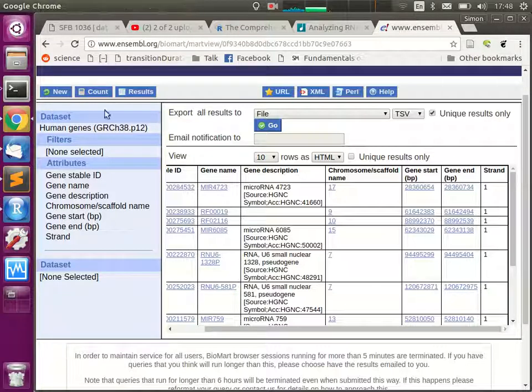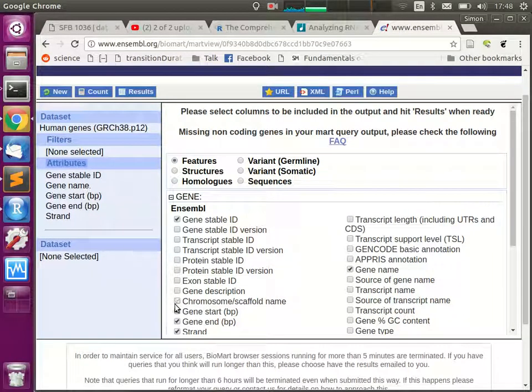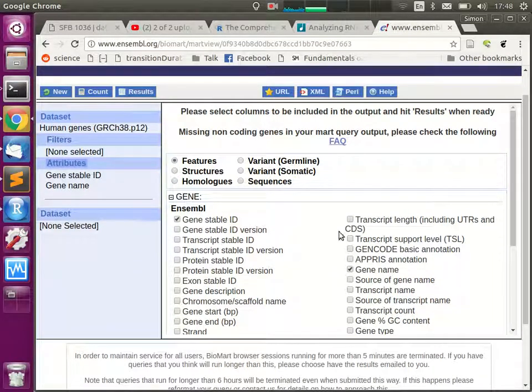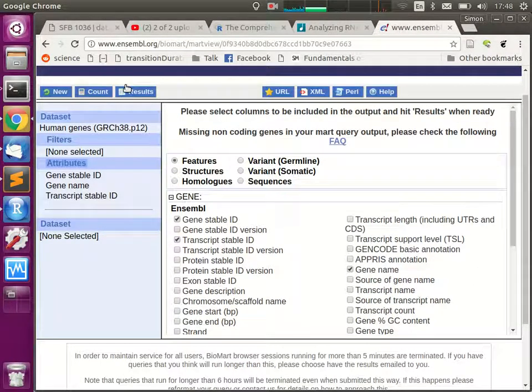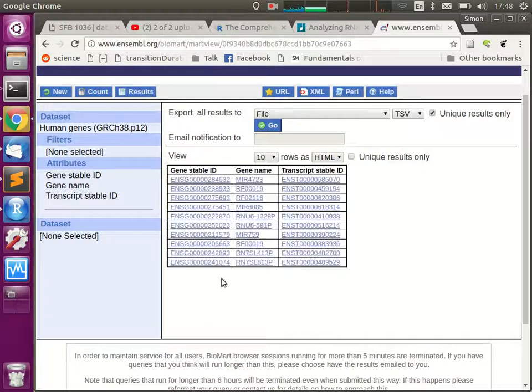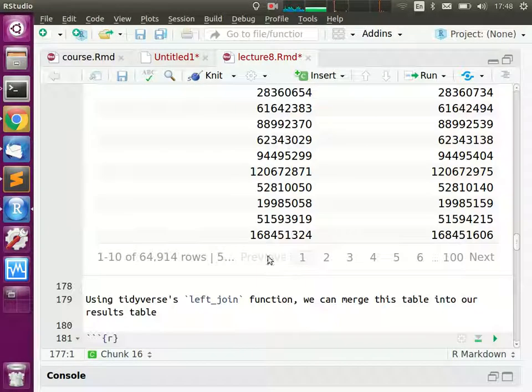And where it appears twice is, for example, and that's the reason why I said I don't want. Where was the gene name? By default, you always find it like this. And why I deselected the transcript ID: if I do this, then you see now I see every gene with multiple transcripts now has multiple rows. No, you can't see it because this happens to be all single transcript genes, but this way.